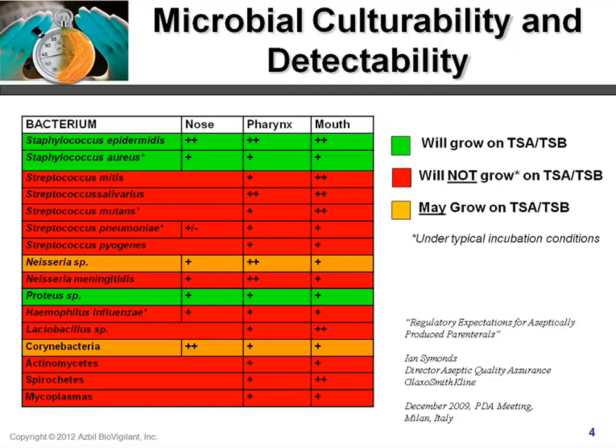In addition to improper growth conditions, other common VBNC vectors include damage and environmental stressors like starvation, desiccation, and chemical exposure. If those methods of stressing microbes sound familiar, they probably should, because those are the conditions that are typically found in most clean spaces, particularly those related to the pharmaceutical industry. So many microbes that may exist in these environments are already predisposed to being stressed and potentially not detectable using traditional methods.